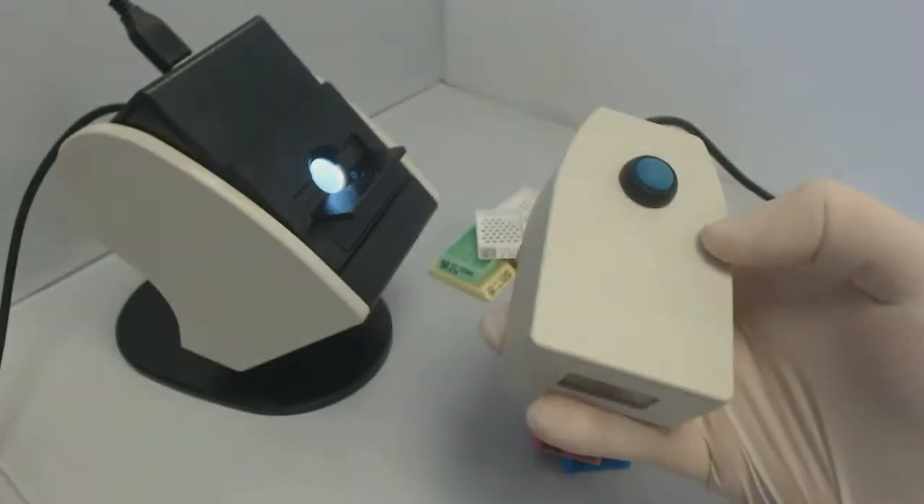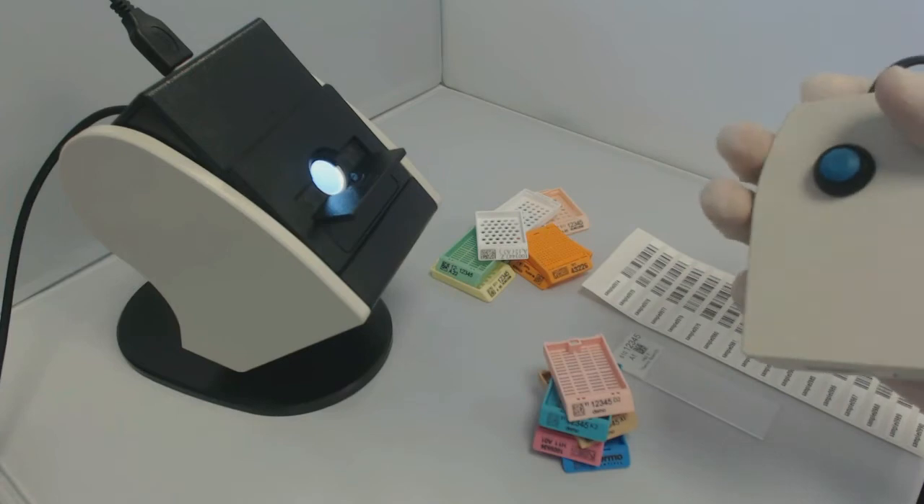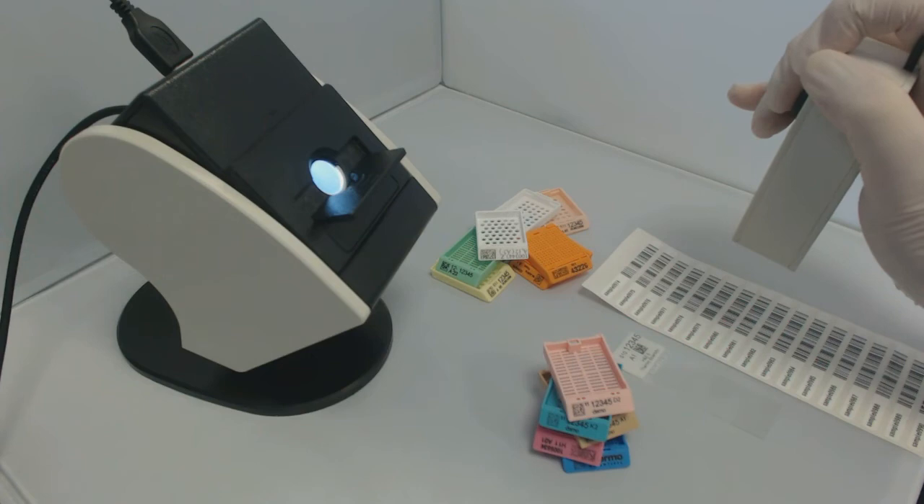Our handheld scanner, called the WAND, is a robust reading solution. It complements the LabScan, offering readability of all barcode types, very quickly and efficiently.